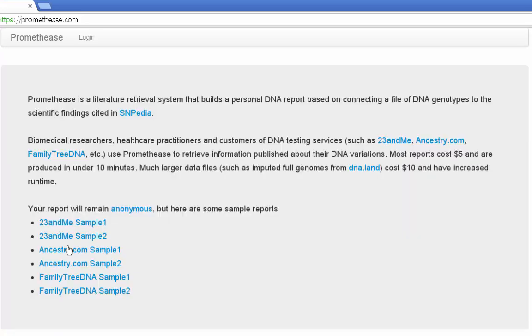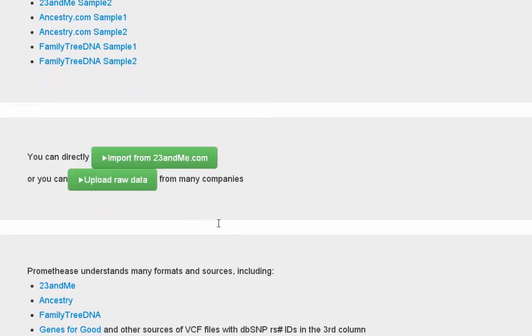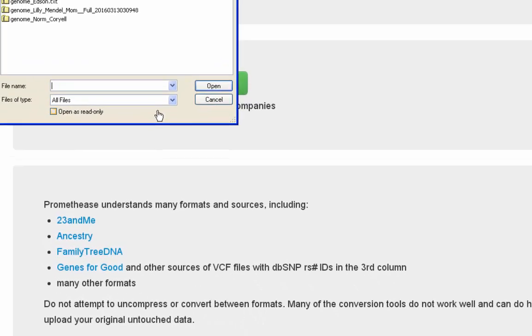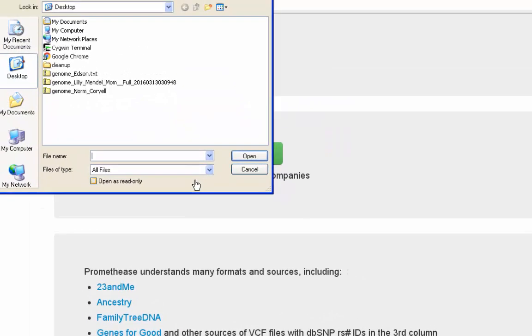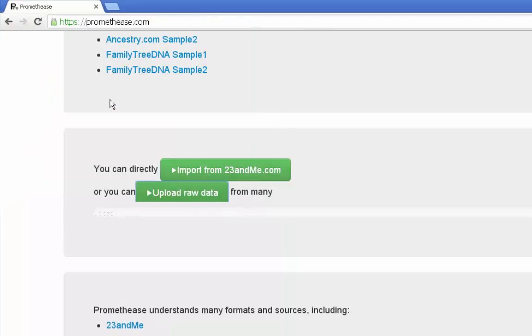At the bottom of the main page you'll see the names of some of the sources of data that we accept. Click on those names for more specific help. Upload raw data from your computer and then watch the progress bar.